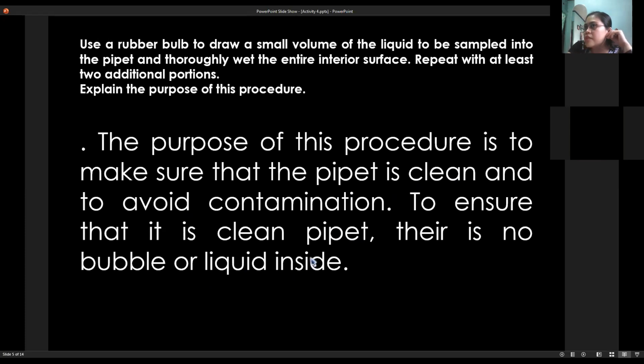We also searched for the reason or purpose why we clean our pipette. The pipette is made of glass, and it can absorb and retain water on the surface. Because of the polarity of the glass and the intermolecular forces, you have to rinse the pipette with the solution you will use, because distilled water can change the concentration of the initial solution and will produce an incorrect result.